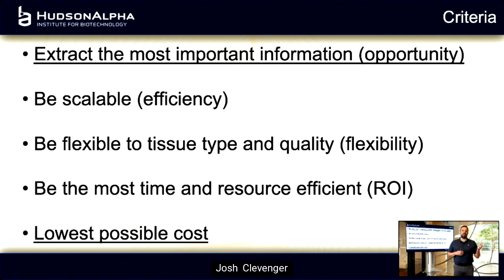So I talked to you earlier about all the different tissues and all the different plant and animal species and microbes that we've sequenced and worked with. All of those bring different challenges in terms of DNA, how to get the DNA quality. Really having the ability to have confidence that no matter what you're working with, you're going to have DNA and it's going to go into a process that you're not going to have to redo because it didn't work well. Because every time you have to redo things, that costs you money. And again, in this environment where money becomes a really big limiting step, those situations limit your ability to make the most impact.